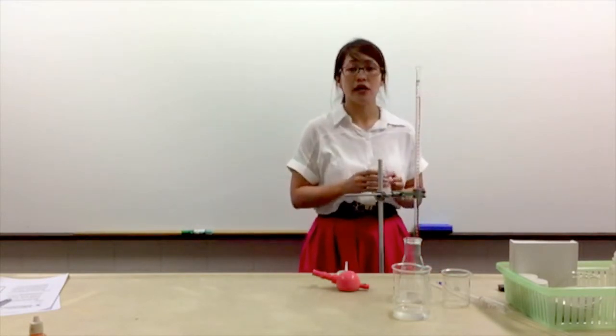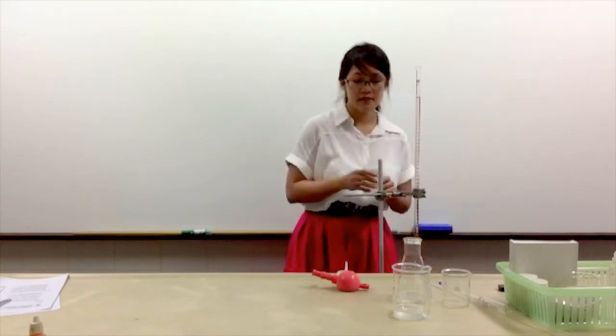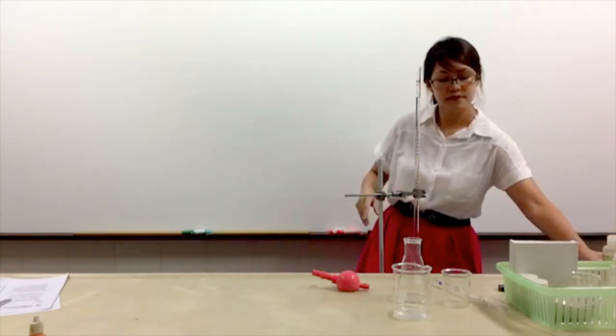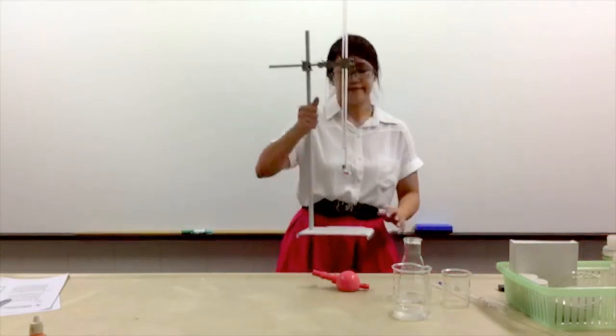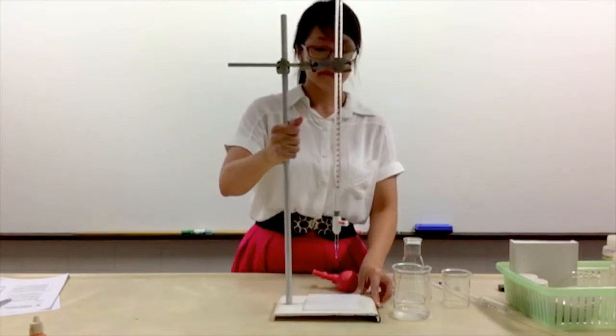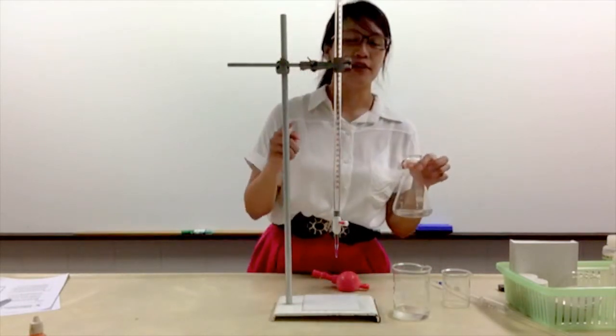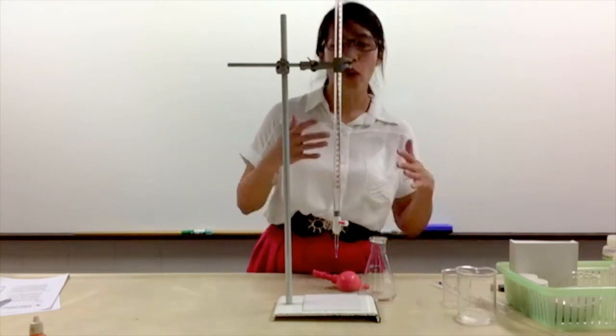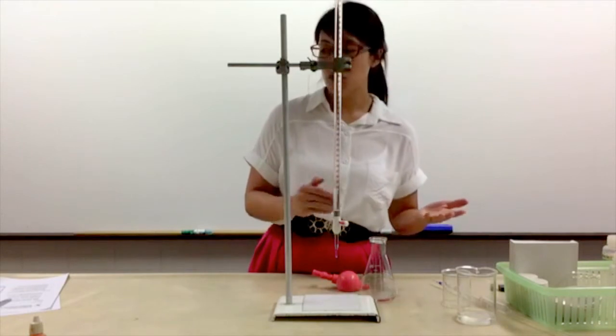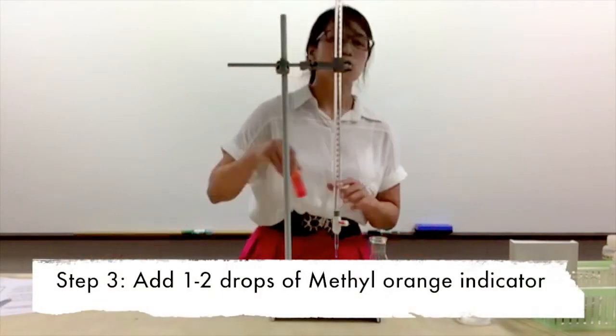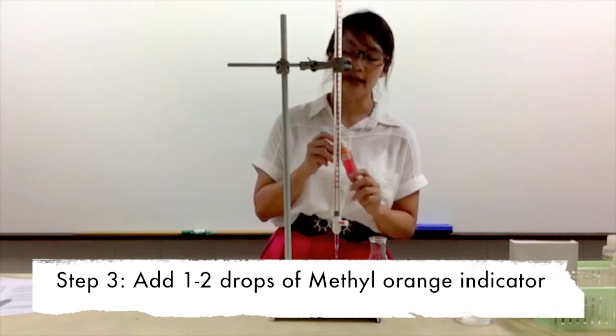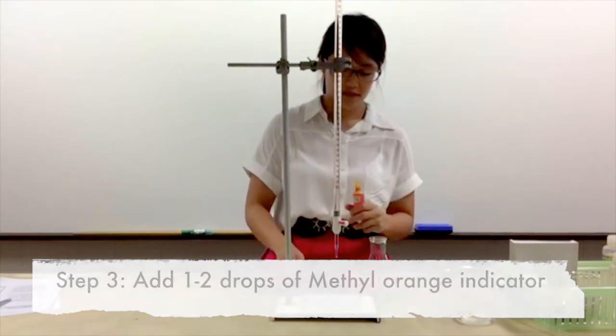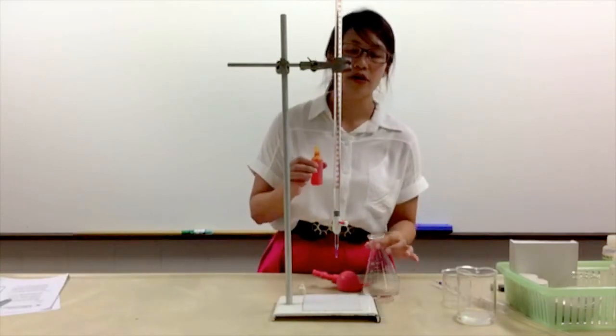Make sure you lower your head to prevent parallax error. You will realize that both the acid and alkaline are colorless, so you will need to know when to stop the reaction. What we do is add a drop of indicator - in this case I'm using methyl orange. When I add methyl orange into acid, it immediately turns red.